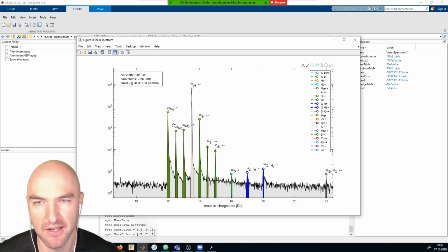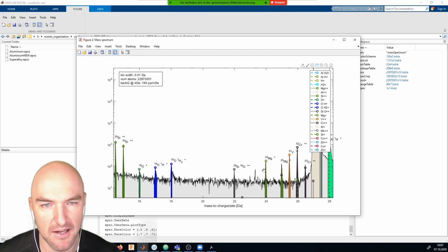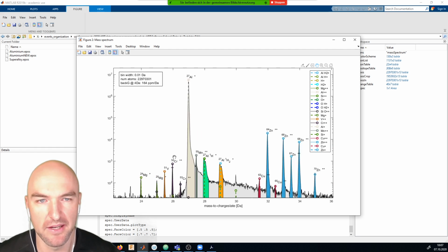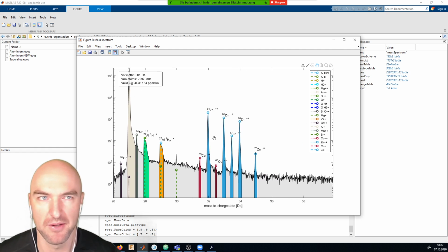What you can see here is that you have ranges and you have ion definitions. The circles stand for the ion definitions. For example, we've got chromium, and one peak here doesn't have an associated range because this is aluminium. This is mostly aluminium in this peak, and only very, very little chromium. Martina will show you in the next session how to prepare something like this.